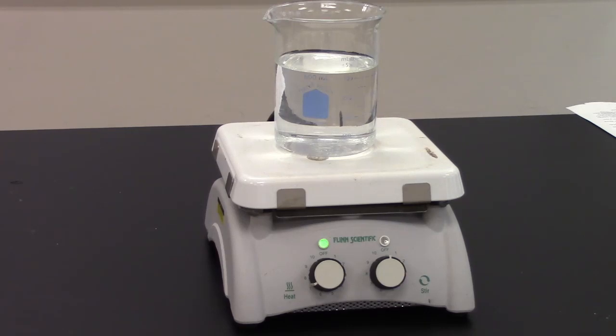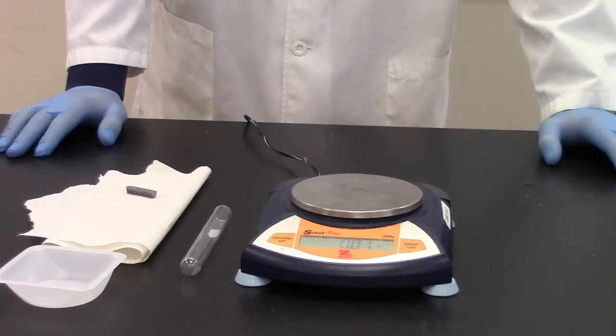So our first step in this lab is to fill a 600 milliliter beaker about two-thirds of the way full with water and we need to get that on our hot plate as soon as possible to get that water boiling. Remember, water boils at 100 degrees Celsius.